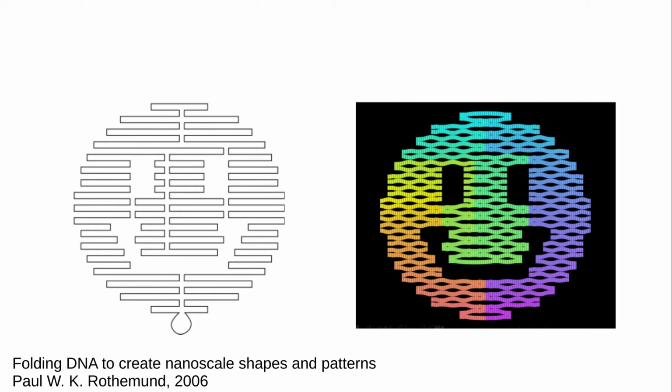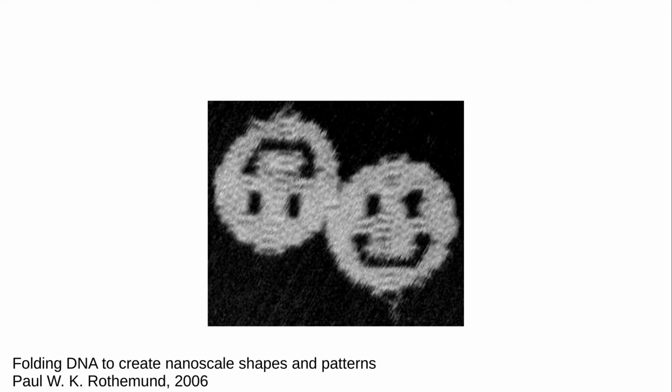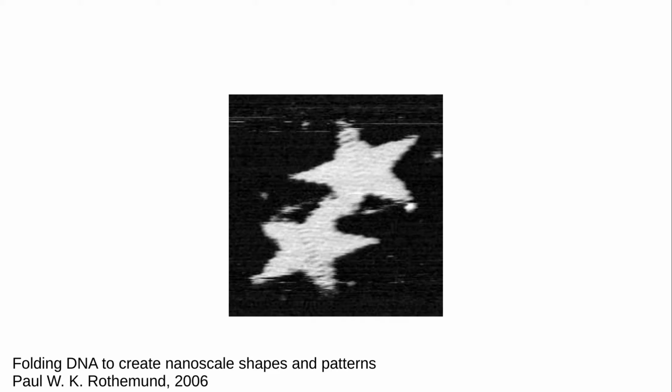Researchers have been able to generate specific shapes using this technique, showing the proof of concept for a smiley face, and this is the AFM image obtained from the real object. This is another example for a star shape.